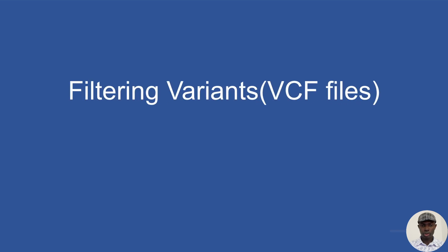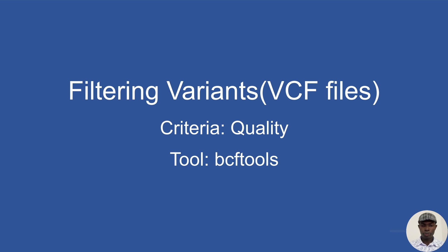Hi everyone, welcome to the Bioinformatics Coach channel. In today's video I'm going to show you how to filter variants. I'll read an example VCF file and filter it. For the criteria I'm going to use quality. There are different criteria available — you can filter based on quality, variant type, chromosome, etc. For this tutorial I'm focusing on quality, but in subsequent tutorials I will show you how to filter based on other criteria.